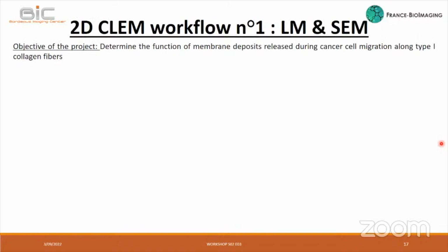So now I'm going to show you several workflows used on the platform. The first one is a combination between light microscopy and scanning electron microscopy. We used this workflow on a project on cells coating on collagen fibers.